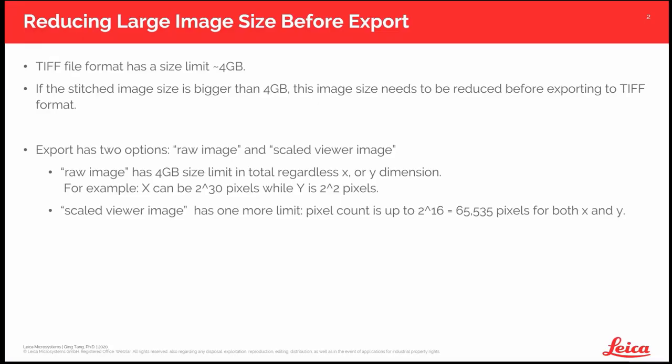Still, you likely need to export the big stitched image for presentation or publication. That's our next topic. First of all, note this fact: TIF file format was developed many years ago when they used 32-bit offset to store the image data. That leads to roughly 4 gigabyte in file size.